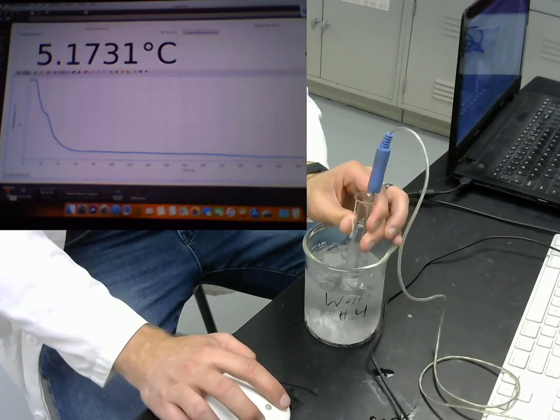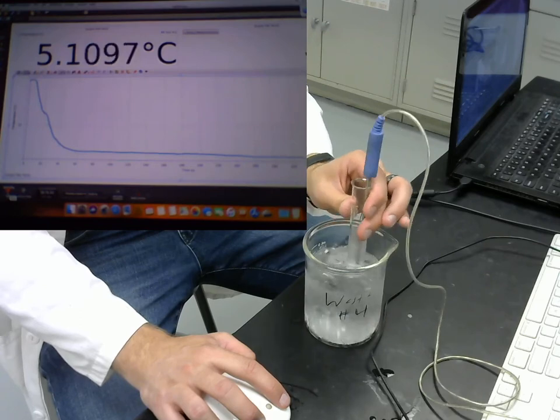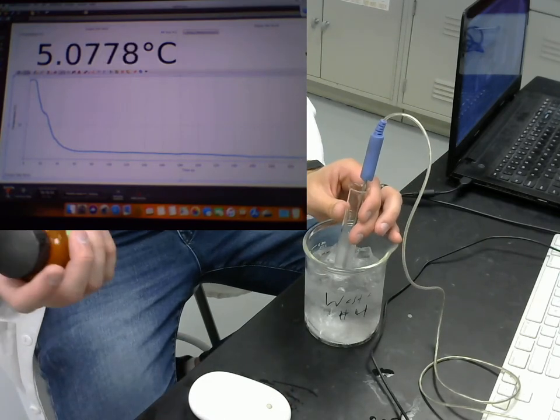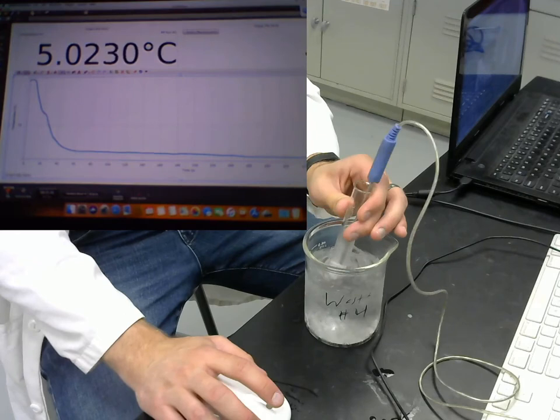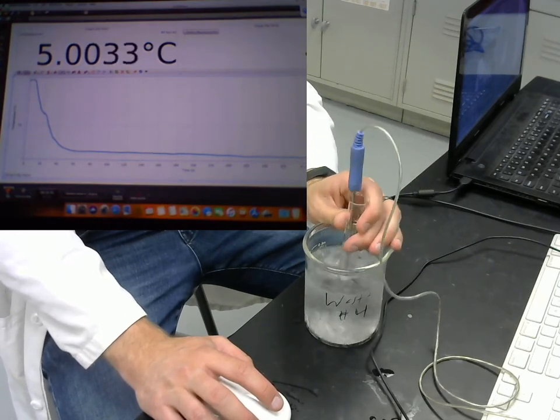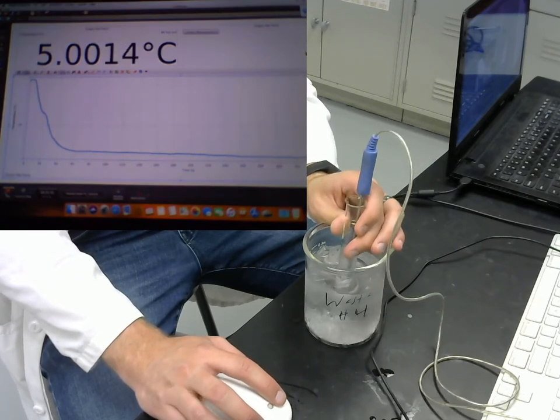So that is with the pure cyclohexane. The next part of this lab will involve a mixture of cyclohexane with some other substance. I chose naphthalene, which was one of the options given in your lab. So we'll go weigh out those quantities so that we can be quantitative about the molal concentration of our solution, and go ahead and make cooling curves for that mixture.